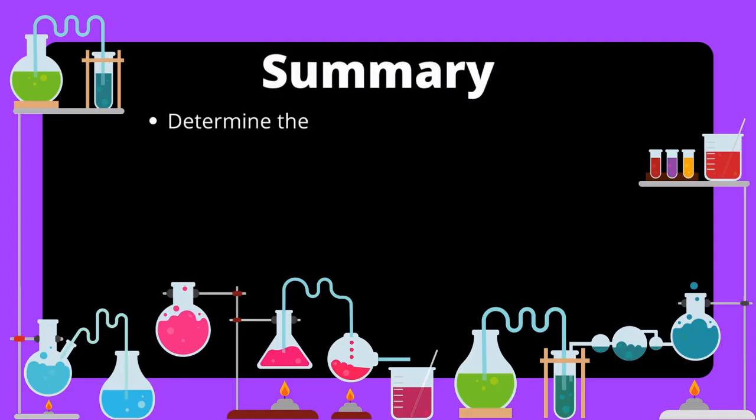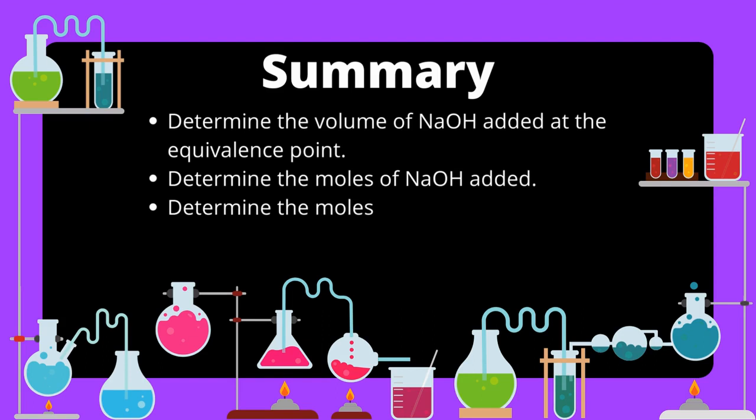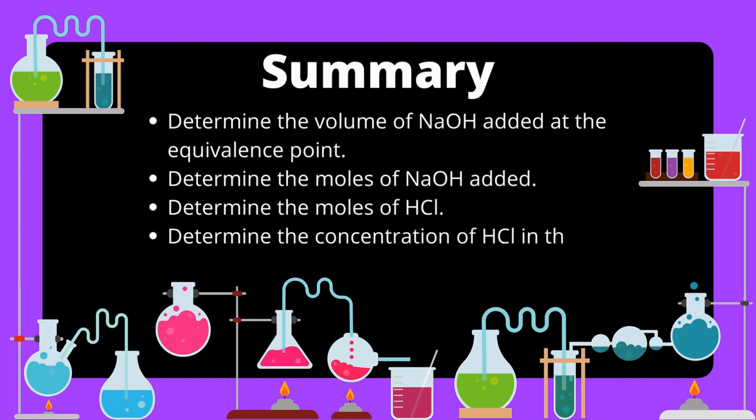In summary, using the data provided, determine the volume of sodium hydroxide added at the equivalence point. Determine the moles of sodium hydroxide added, and use that information to determine the moles of hydrochloric acid, as well as the concentration of hydrochloric acid in our original unknown solution.